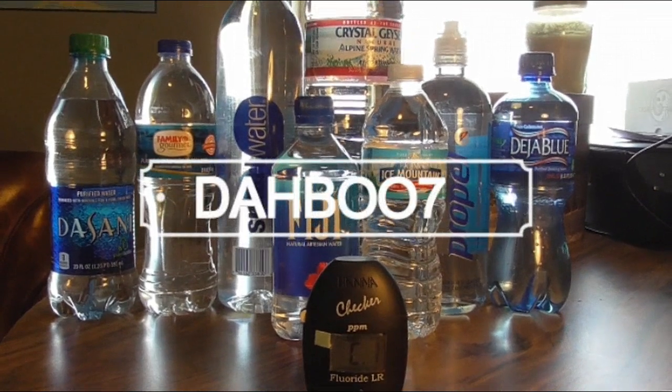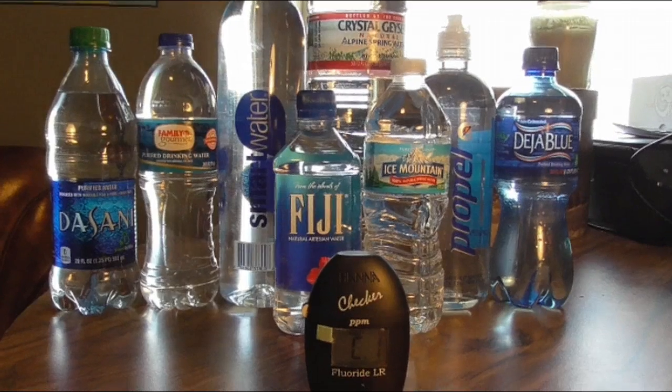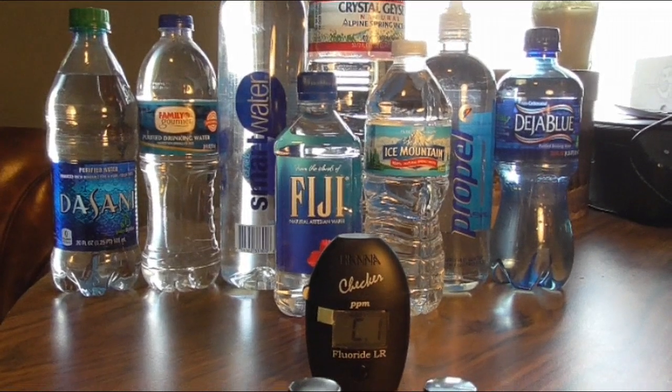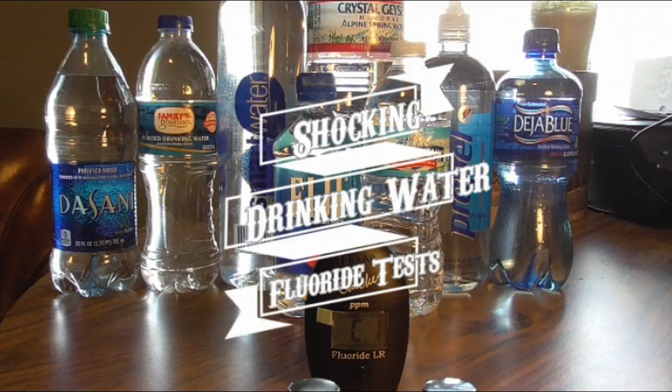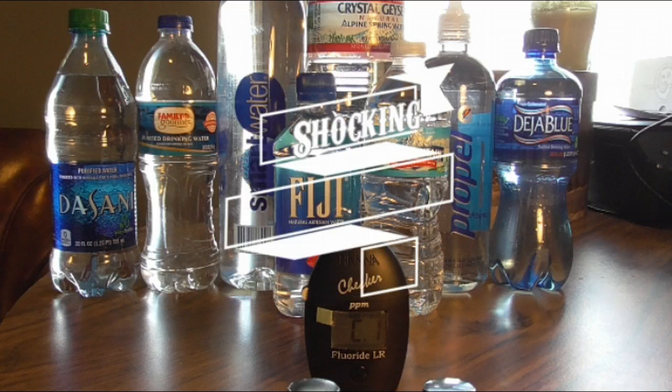Hey guys, Daboo7. You're looking at a fluoride checker and a lot of popular bottled water. I've seen a lot of different numbers out there, different tests that have been done in regards to the bottled water.